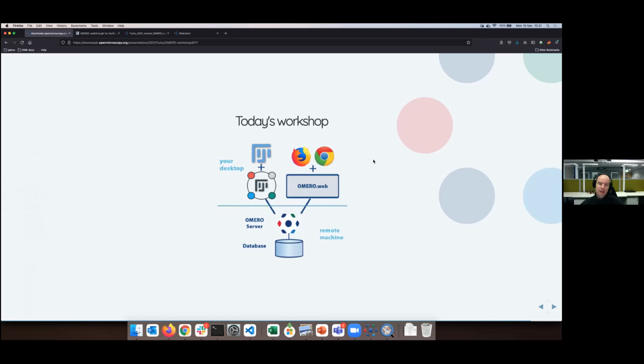Now, this is a slide which highlights the main features of today's workshop in particular, but not in full. Why not in full? It's quite a bit of a job to pop a new icon into such an image, as you might imagine, and thus I didn't manage to do that. Sorry for that. So I will talk you through it. So this is today's workshop.